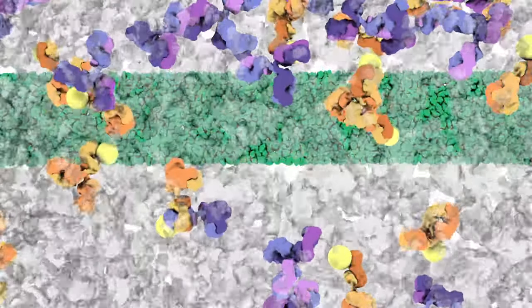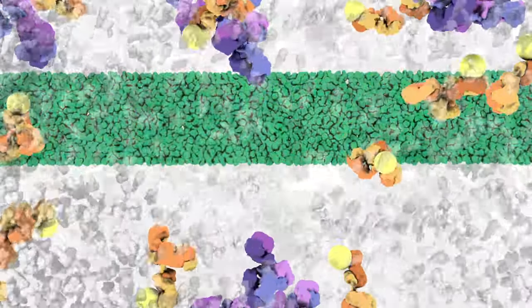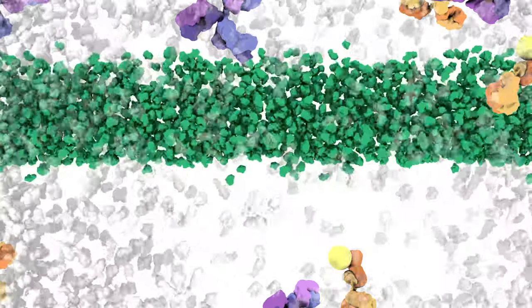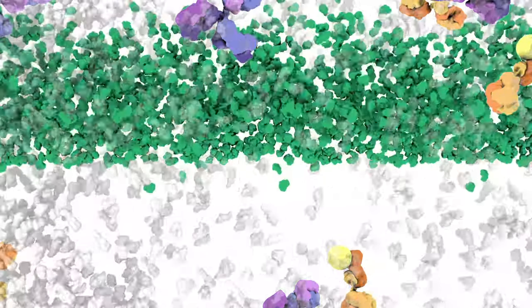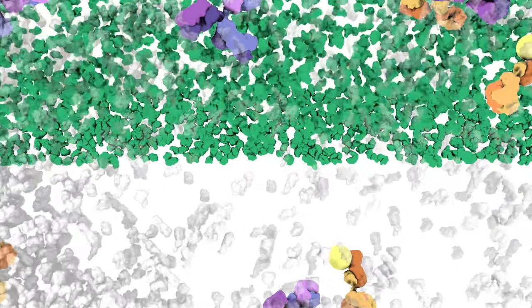Stripping the membrane of bound antibodies is accomplished by incubating the membrane with stripping buffer containing SDS and beta-mercaptoethanol under high temperatures. In the lab, stripping cannot be done more than two or three times before you begin to also strip proteins bound to the membrane resulting in loss of signal.